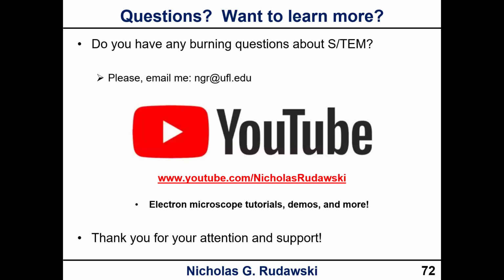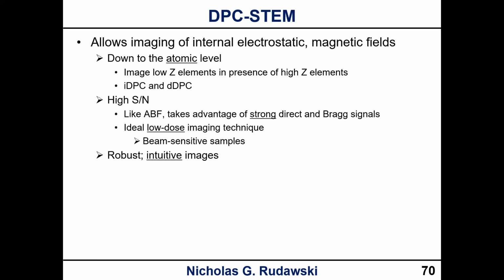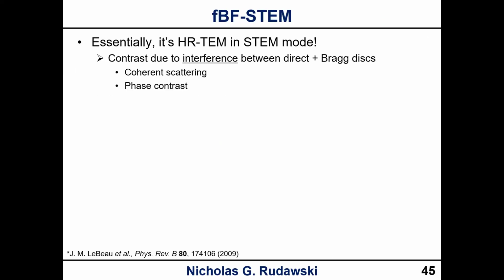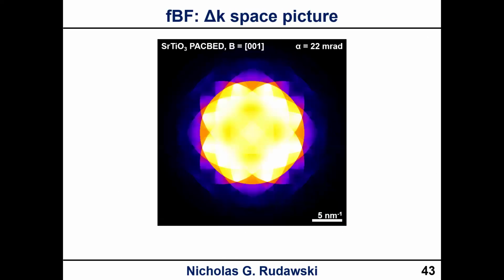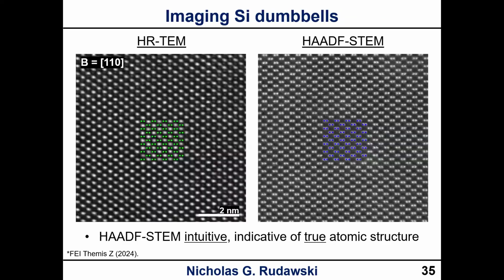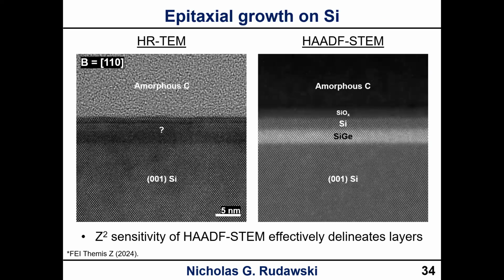That's a good question. It depends on how the atoms are ordered in the solution. I'm going to go back quite a few slides because there's an example of a solid solution here that I can show you. Okay, right here. Silicon germanium is a solid solution, of silicon and germanium atoms.